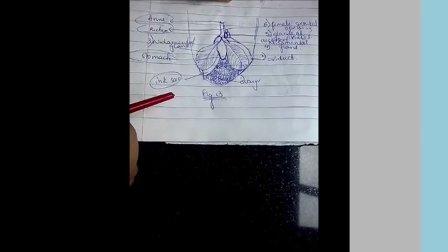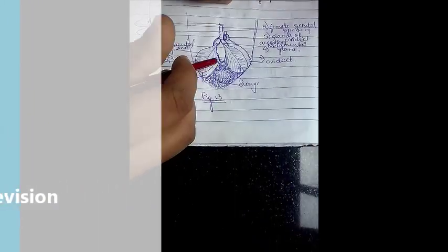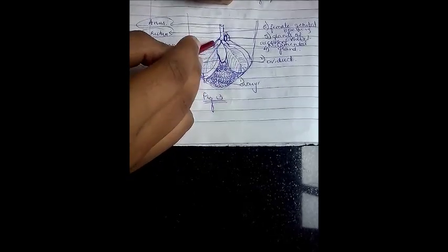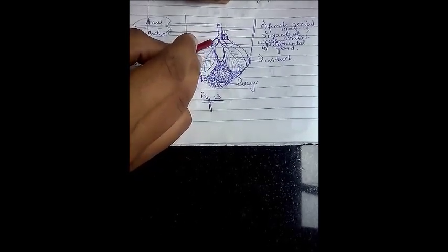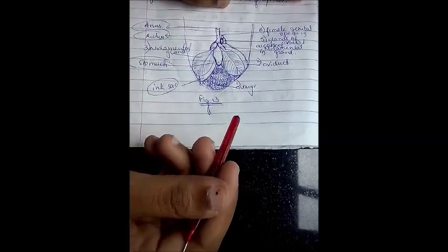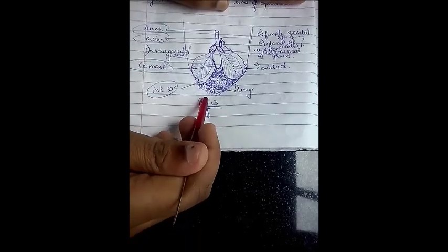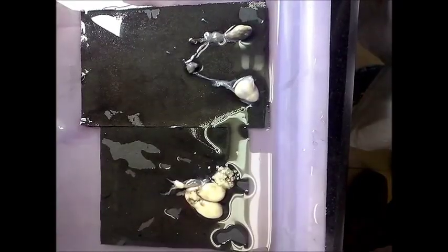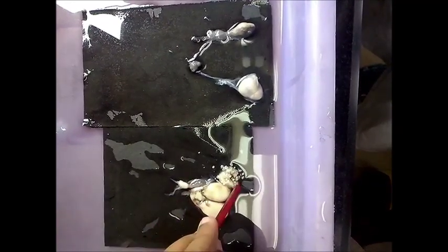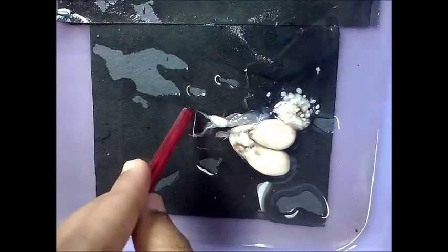Let's do a quick recap of the parts of the female reproductive system in the order that we saw them. First, we saw the nidomental glands, above which were present the accessory nidomental glands. We then saw the oviduct and the female genital opening. On removing the membrane present in between the ink sac, we were able to clearly see the ovary, which confirmed the organism was female. In summary: the nidomental gland, the accessory nidomental gland, the ovary with ova, the oviduct, the glands of the oviduct, and the female genital opening.